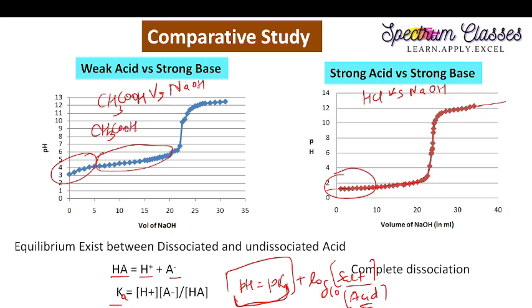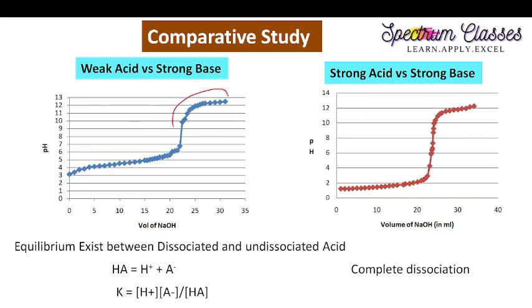This acid is there plus the formation of its salt CH3COONa, which collectively makes a buffer. The buffer, on adding acid or base, resists the change in the pH. So here the pH of the solution increases very slowly. After that, this part and this part are almost the same. So the initial part is changed, this to this much, fine.